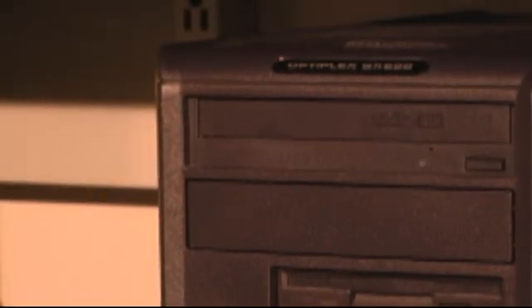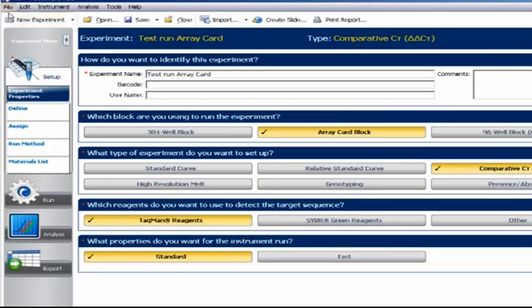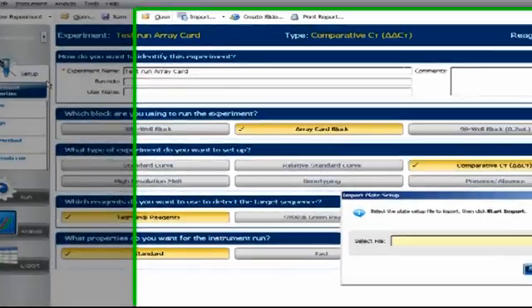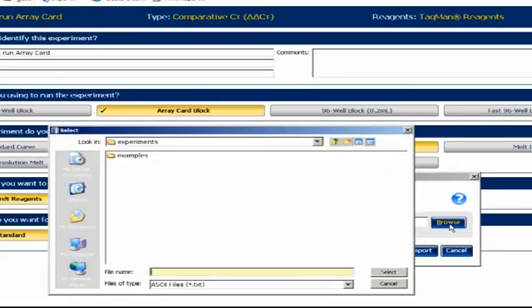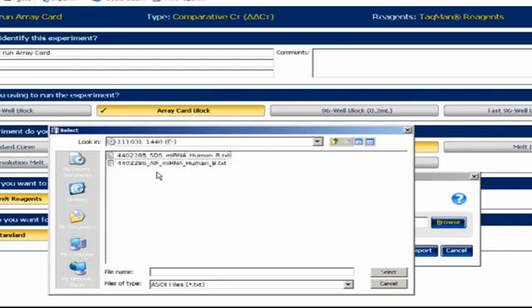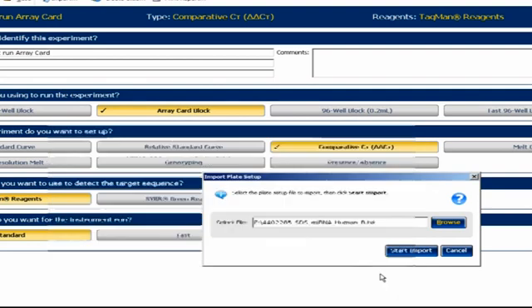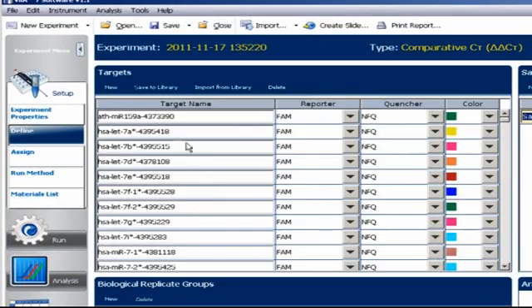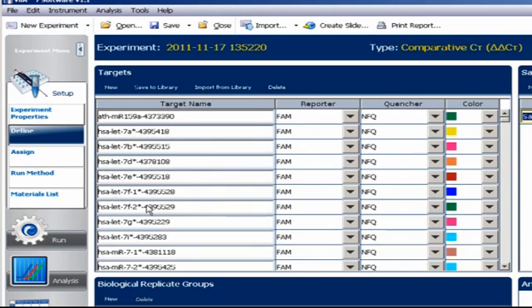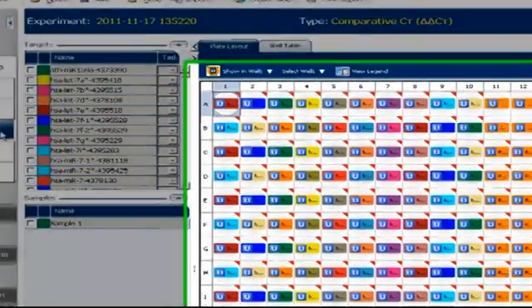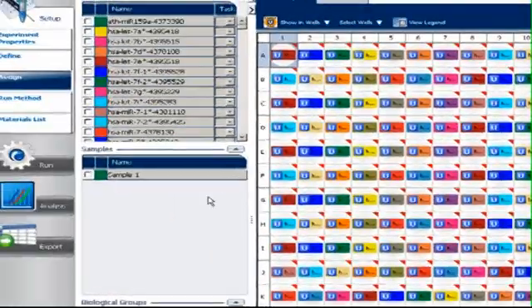Next, take the disk that shipped with the array product and stick it into the computer disk drive. Go to File, Import Plate Setup. Browse to My Computer, and then to the disk drive icon. Select the file containing the letters SDS and Import. As you can see, the gene names get added to the assay list automatically. And if we go under Assign, you can also see that the assay names have been added to the correct wells.